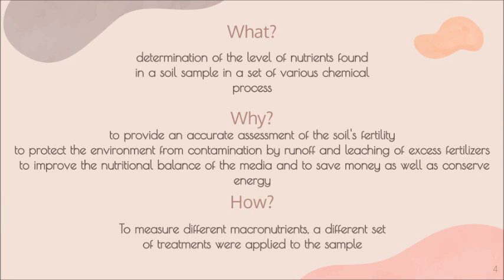So, what is soil analysis? Soil analysis is the determination of the level of nutrition found in a soil sample through a set of various chemical processes. As we know, soil contains a lot of nutrition. So soil analysis is analyzing or getting the information of what the soil contains.